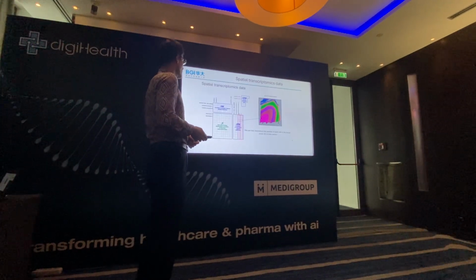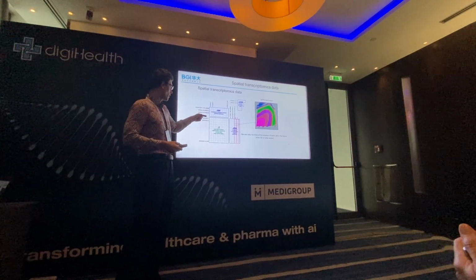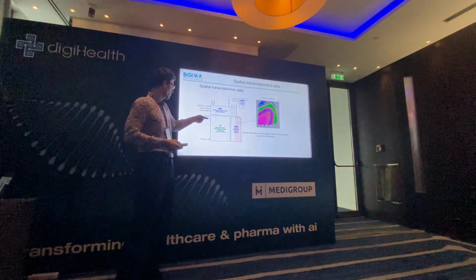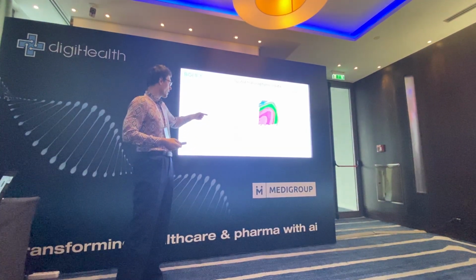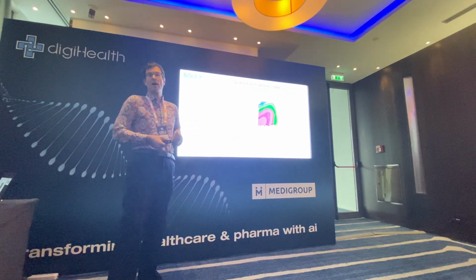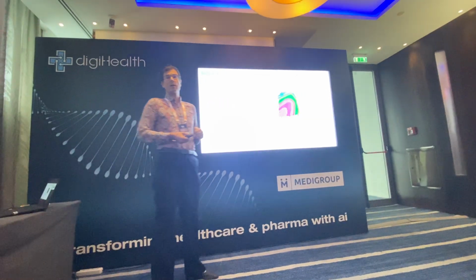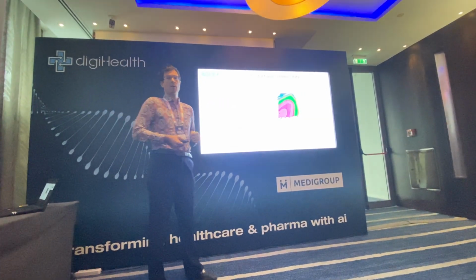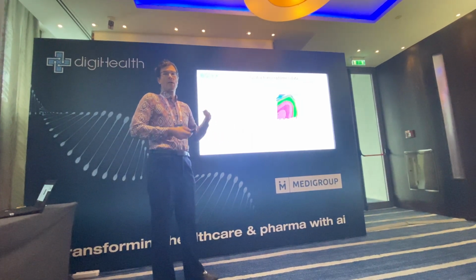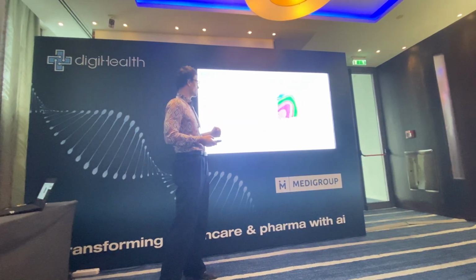So when the sequencing experiment is finished, you actually obtain gene expressions for individual cells. As the rows of this matrix, you can have thousands of cells, in some experiments hundreds of thousands of cells, and as the columns, you obtain gene expressions of the individual cells, like 30,000-40,000 genes for every cell after reading RNA reads from the sequencing process.